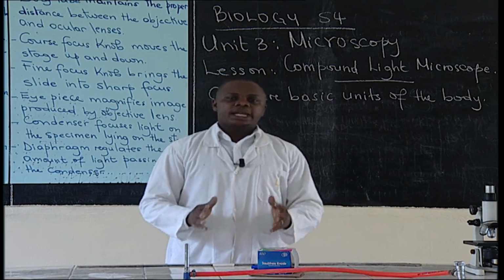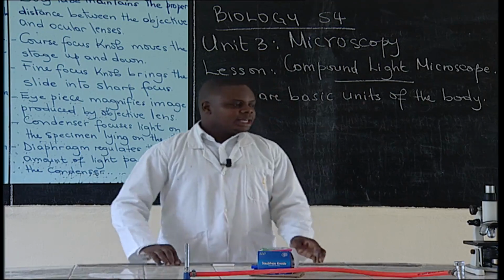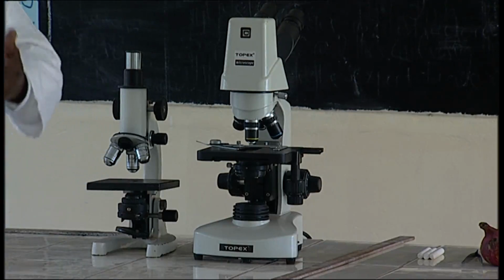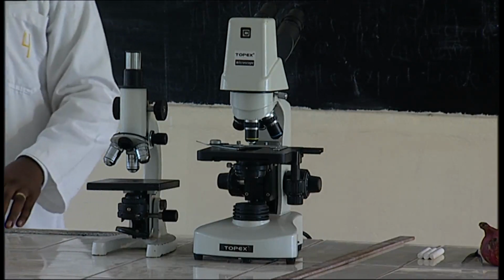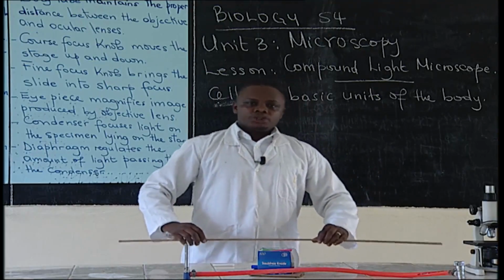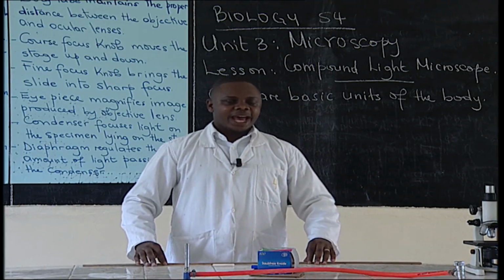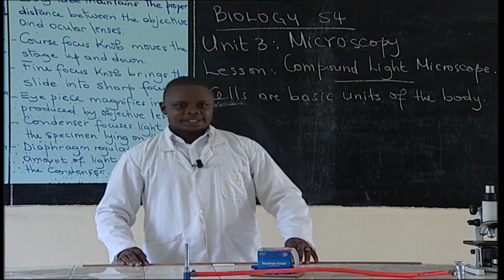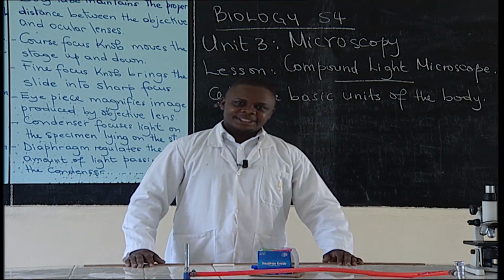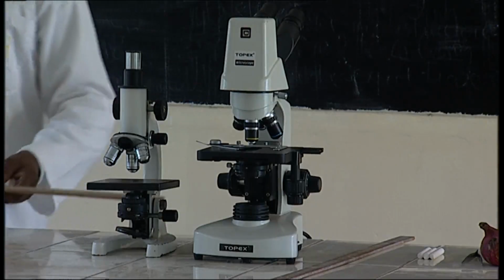So in schools, if we study organisms that have cells which we can't see with our eyes, then we use microscopes to see them so that we can study them when we are able to see their structures. That means hands-on, mind-on activities. It's not only in schools, even in universities, high institutions of learning, they do a lot of research about different organisms. They also study organisms. So in that case, universities also use microscopes.